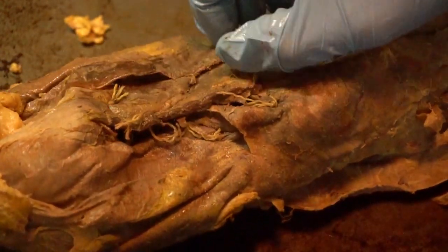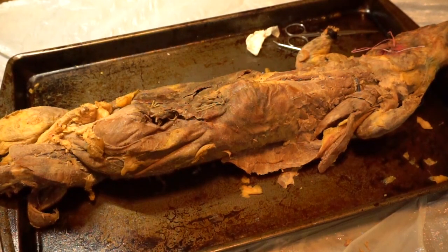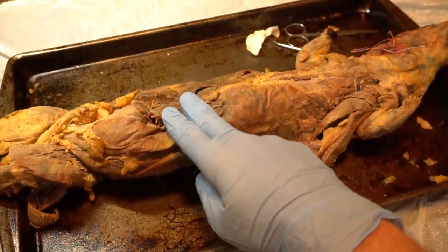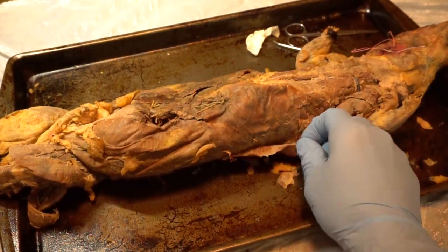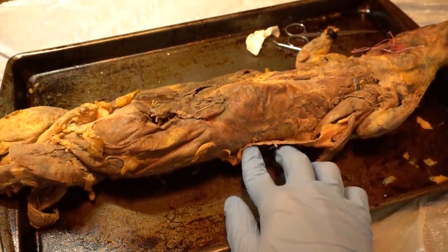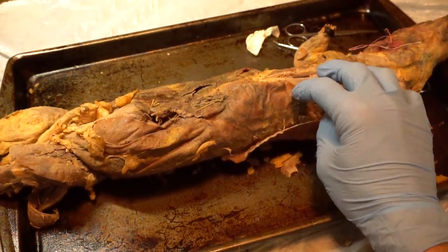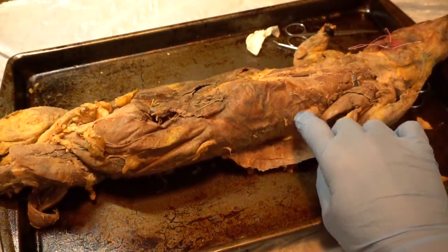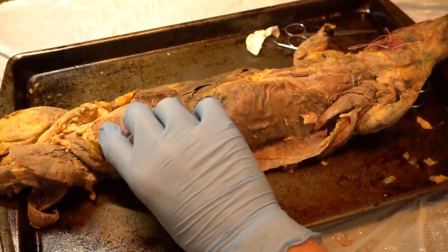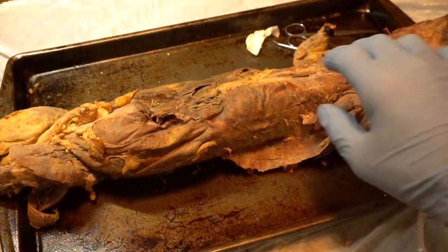One more thing before we move further — make sure nobody gets confused between the external oblique and your latissimus dorsi, which was that wing coming off the back. This was the first muscle we covered. They're very similar and they're on top of each other. The latissimus dorsi, once peeled off, is on top of the external oblique, which takes up pretty much the whole side of the body.